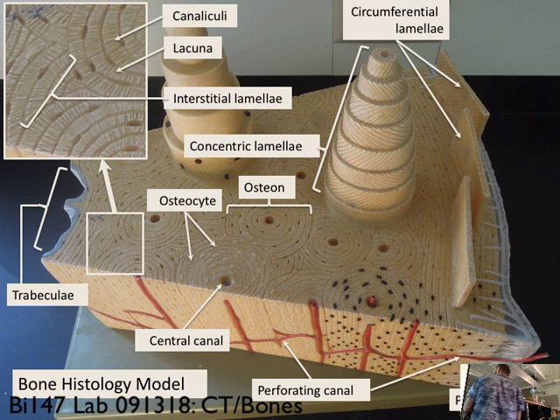Anyways, we see here the periosteum with the fibrous layer and the cellular layer. We see an osteon, which is one of these round areas organized around the central canal. They depict the osteocytes in the lacuna. So these empty spots are representing lacuna. The little bumps on that model represent the osteocytes, and then they're painted dark here to represent the fact there's blood in there too.